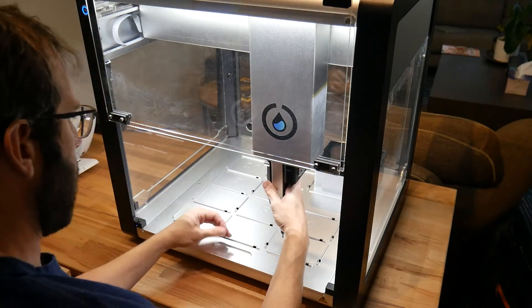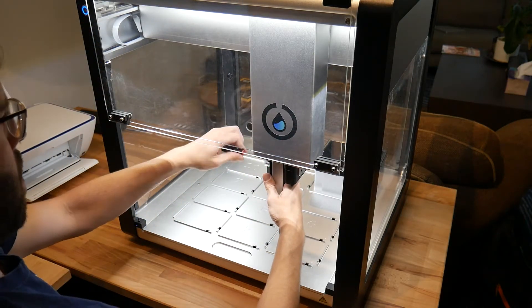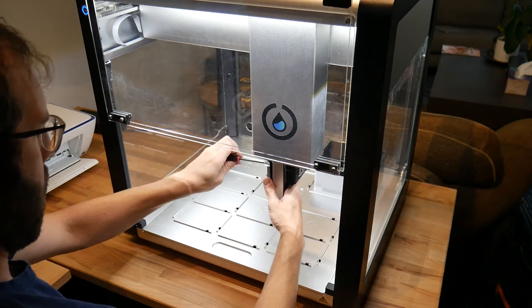Opentrons' pipettes are modular. You can swap out and change the pipettes as easily as changing a few screws, which allows you to use any combination of pipettes that you need for your experiment.